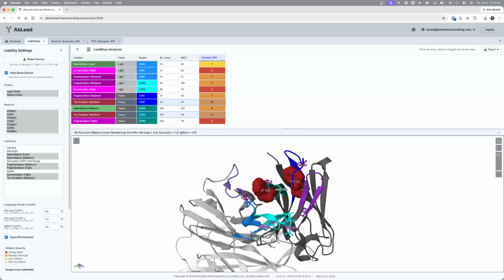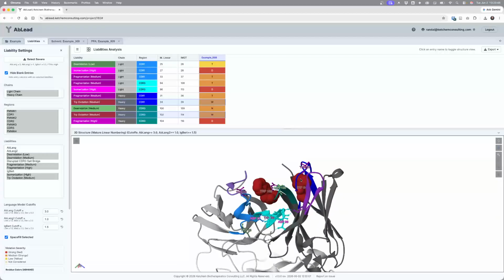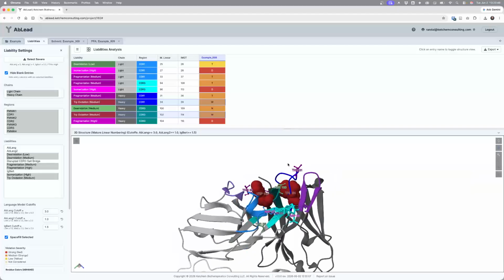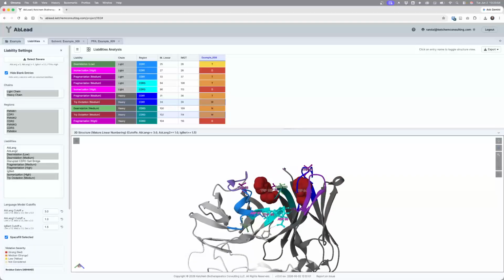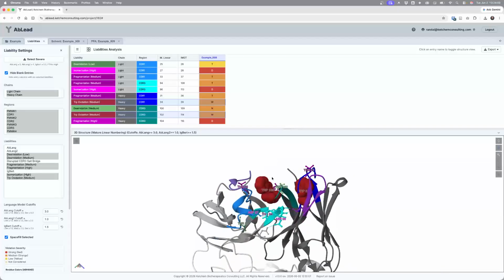They are susceptible to light-based degradation that forms yellow color in material. They can oxidize and degrade. They can impact function, but they're likely necessary for antigen engagement. Difficult to modify, but if necessary in an actual liability repair scenario, I might try to modify these. In this example, I will not.